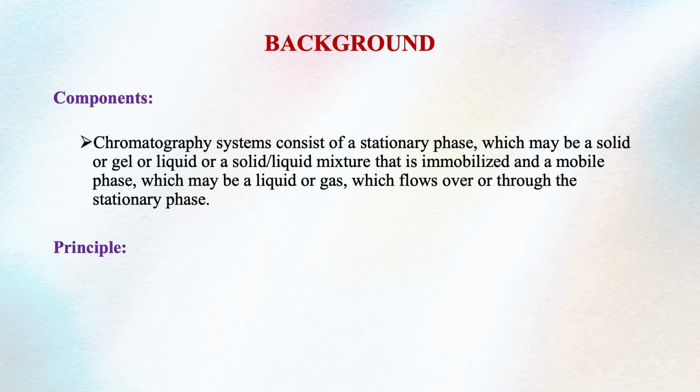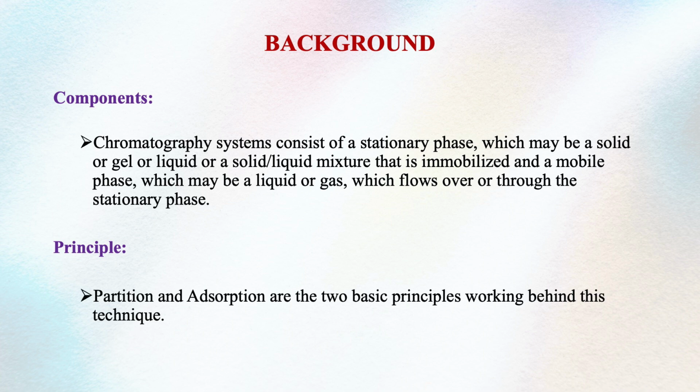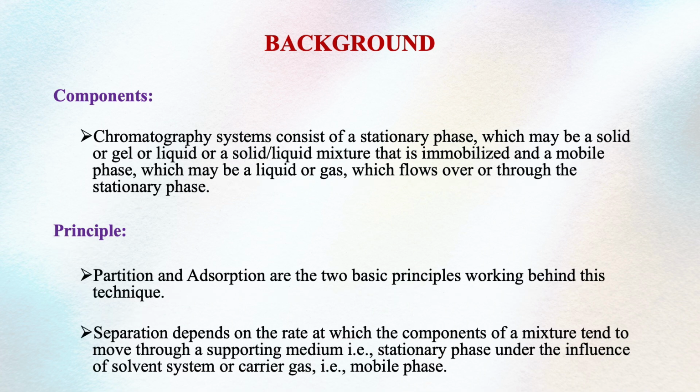Now let us see the principle. The principles working behind this technique are partition and adsorption. These are the two fundamental principles operating in this technique. As I said, the separation in this technique is purely dependent on the nature of the sample that we are going to separate.